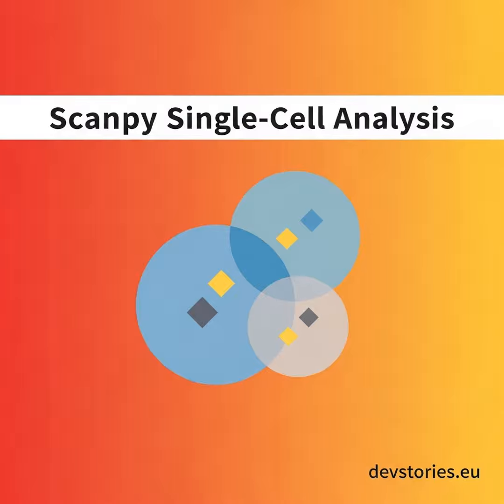First, a quick distinction. You have already used a basic filtering function to drop genes that are barely detected across your dataset. That step cleans up technical noise and empty droplets. Highly variable gene selection does something entirely different. It assumes the remaining genes are real, but asks which of them are actually informative.